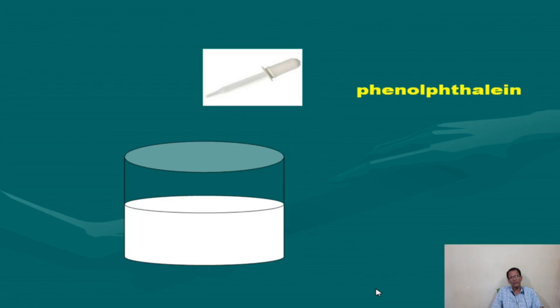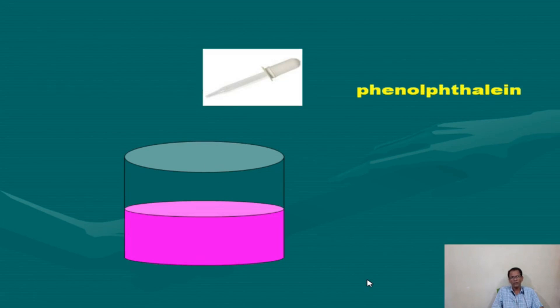Phenolphthalein — when phenolphthalein drops are added to base, it forms a pink color. This is one important characteristic of base: base reacts with phenolphthalein to produce pink color.